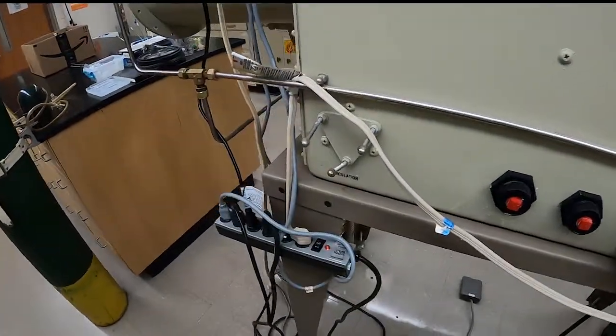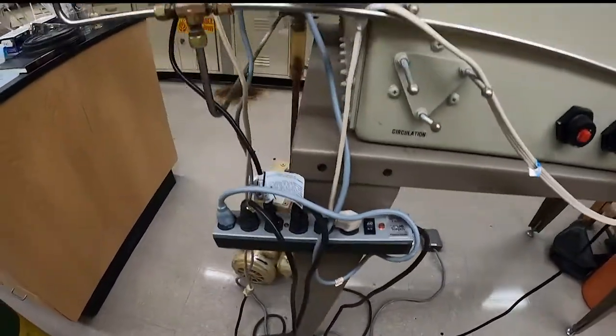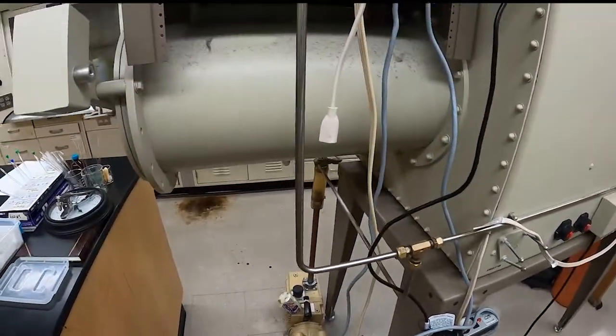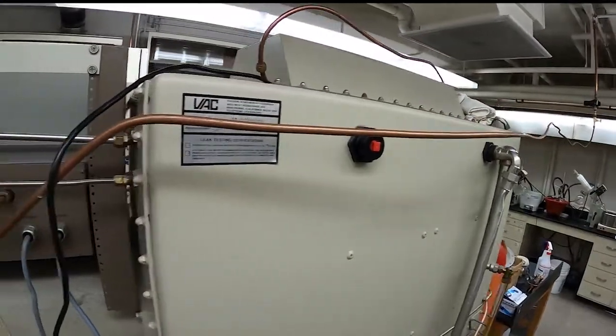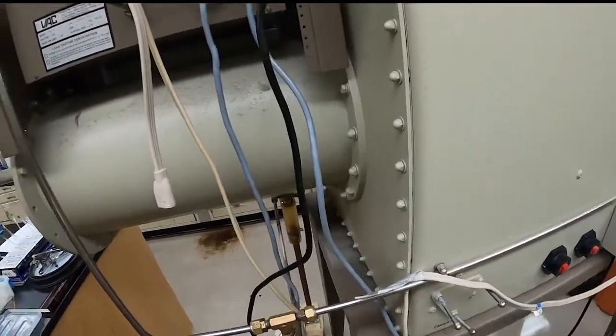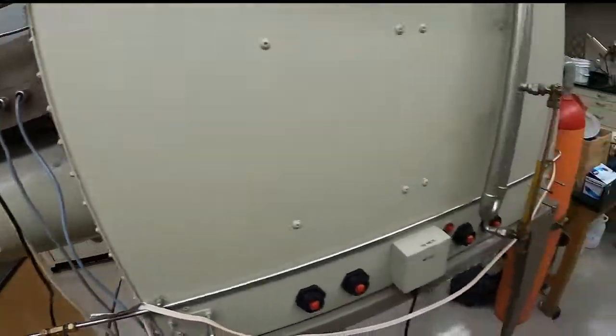We've got the power inlet for the glove box, which is plugged in here, and various other power ports. And here you can see our inert gas line going into the pressure manifold on the front.